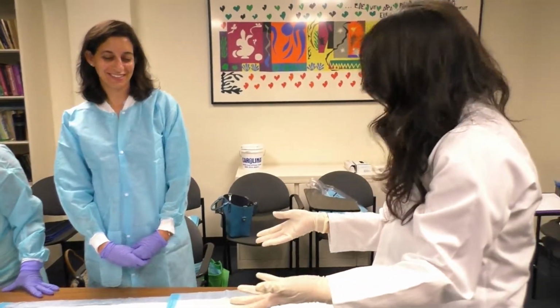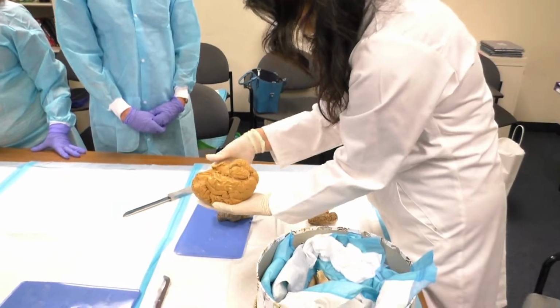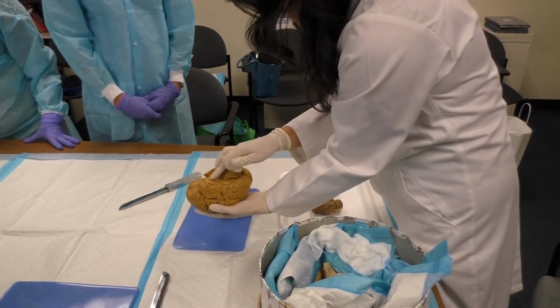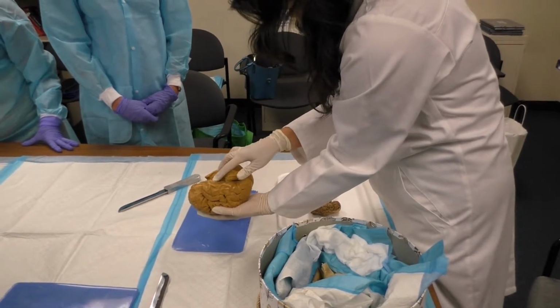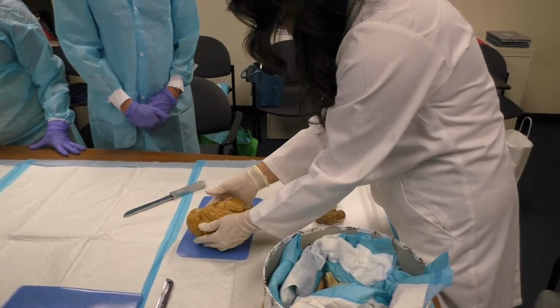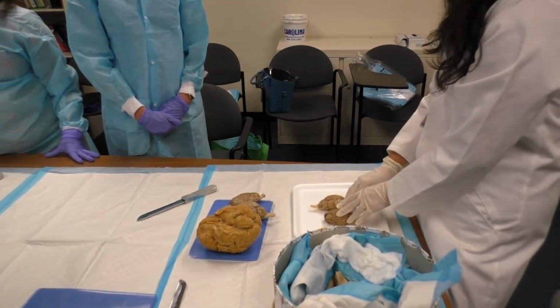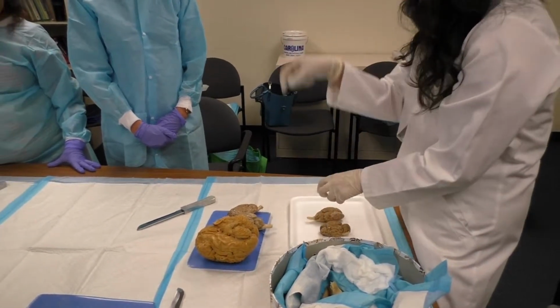It happens that the hippocampus is my favorite area as well, so I've studied it for the last 25 years. And it is deep in the temporal lobe right here, kind of below. It's a tube-shaped structure in the human that goes right here. And one of the things I want to do with some of these extra brains is to do a hippocampal dissection for you for the sheep brain, because it's really fun to pull it out and see.